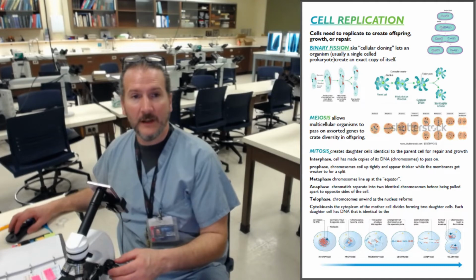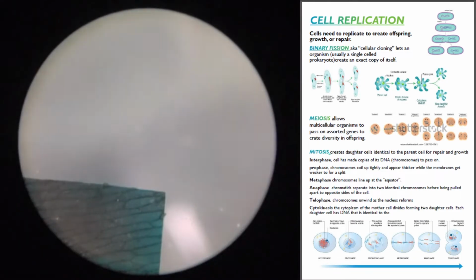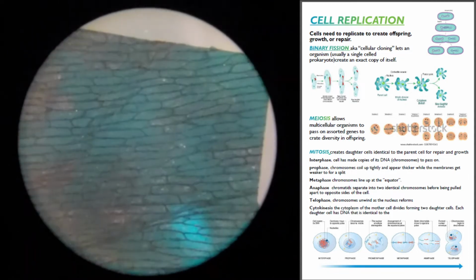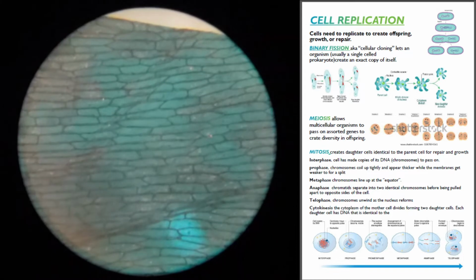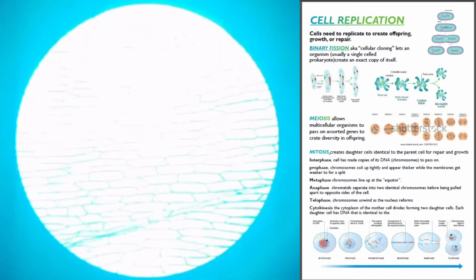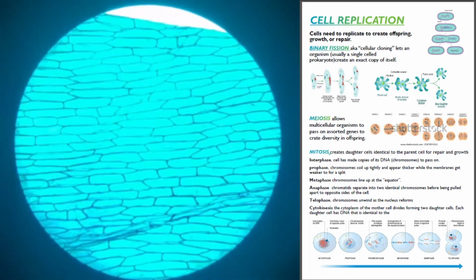Okay. And I'm going to look at my scope again. Wow, look at that. Green, so green. So you can stain things real green too. Pet stores have it for aquariums. It's super green. Okay. I'm going to turn on the light below. Swoop. Look at that. So cool.